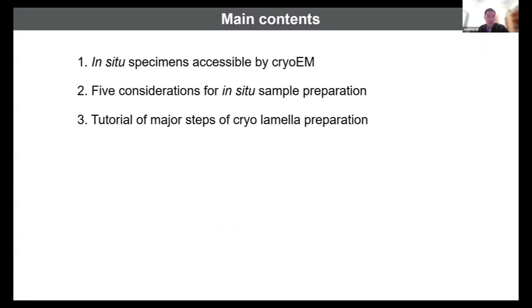So this talk will be divided into three parts. In the first part, I will briefly talk about in situ specimens which can be studied by cryo-EM. And then we will talk about 5 considerations for in situ sample preparation. And after that, I will give a brief tutorial of the major steps of cryolamella preparation.